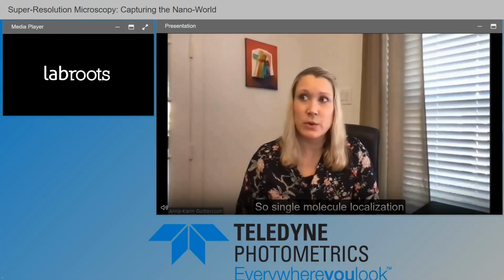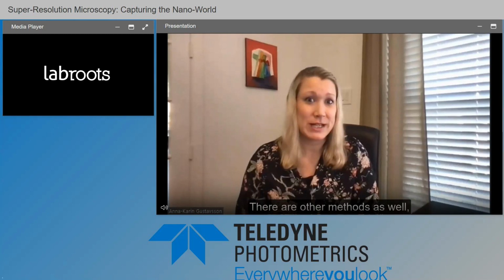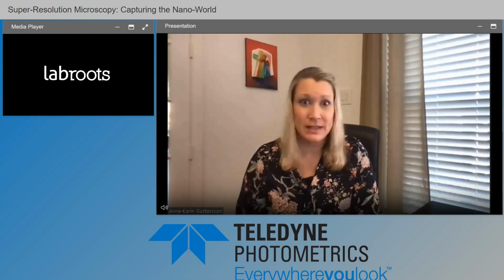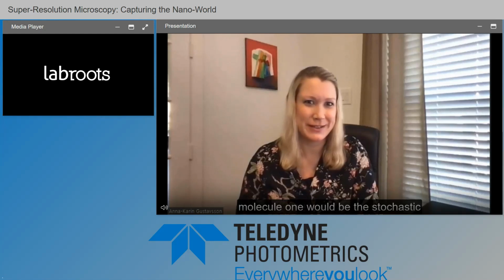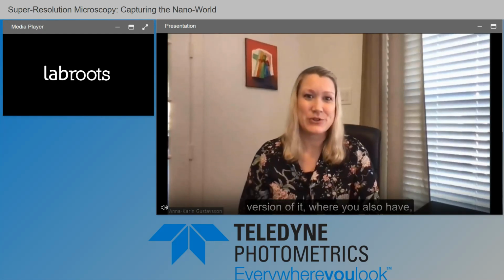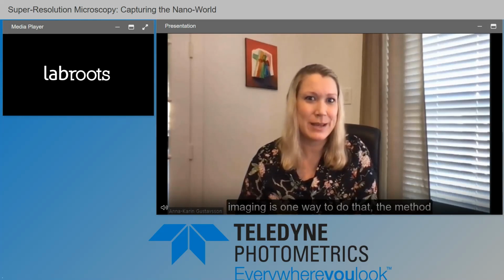So single molecule localization microscopy is one way to achieve super-resolution imaging, or to really circumvent the diffraction limit. There are other methods as well that we like to call deterministic versus stochastic methods, where the single molecule one would be the stochastic version of it, where you have, for example, STED imaging, structured illumination, other approaches that are more deterministic. But there are other ways to circumvent the diffraction limit, but single molecule imaging is one way to do that.